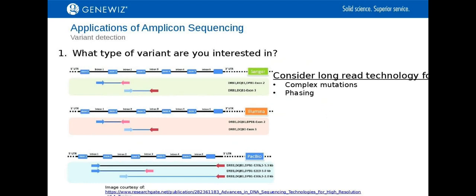Small SNPs and indels are typically captured with shorter reads from both Sanger sequencing and Illumina-based NGS. However, the ultra-long reads of the PacBio Sequel, for instance, can be used to detect very tricky indels or even gene rearrangements that can span longer than the aforementioned Sanger and Illumina reads. Moreover, longer reads are ideal for what's called phasing. In layman's terms, this is an assay to determine if a certain variant is located on the same allele for multi-chromosomal organisms. And this is only achieved if the read length can span those types of variants.